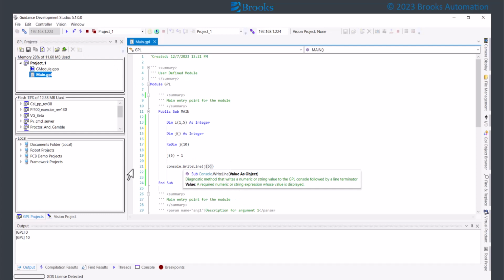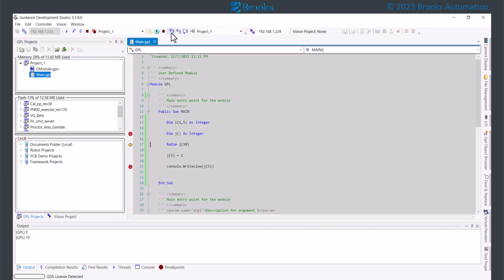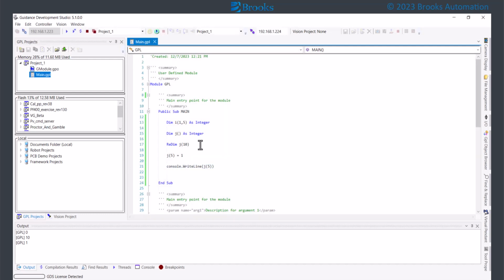Once an array has been declared and its dimensionality established, the redim instruction can be used to initialize or change the number of elements within any dimension. Redim can be applied to any array, so no distinction is made between dynamically sizable arrays and fixed arrays. However, redim cannot be used to change the rank of an array, and redim cannot be used to initially declare an array.